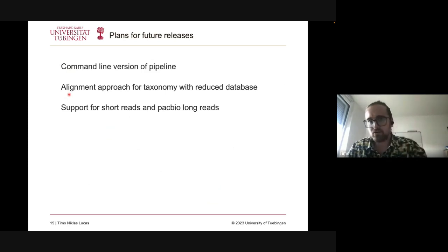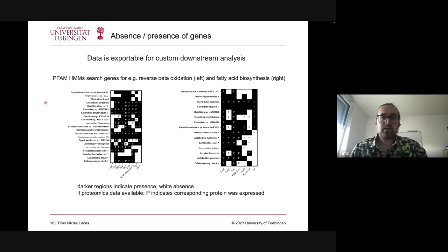It will take much longer, but my colleagues are working on figuring out how to use reduced databases to get alignments quicker. So this is something I'm going to look into. And we might also be able to support short reads or PacBio long reads, not only Nanopore reads, because there are more sequencing devices used than just Nanopore devices.